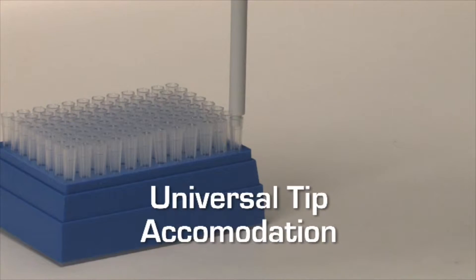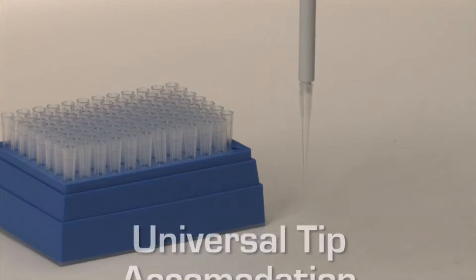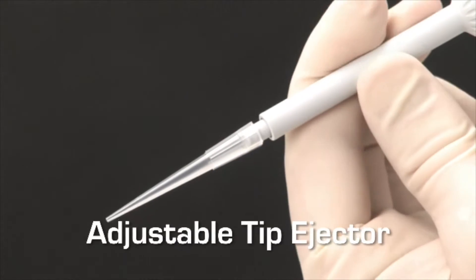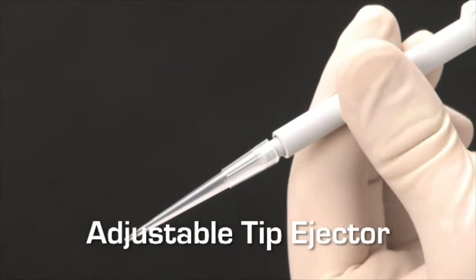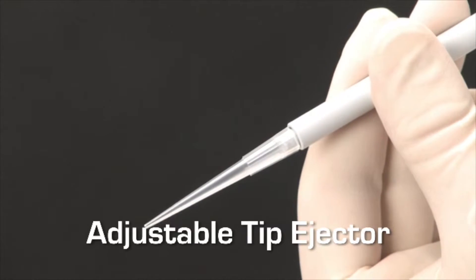Acura manual pipettes can be used with most popular brands of disposable tips. The tip ejector can be adjusted by the user so that it's always in the best position for effortless tip disposal.